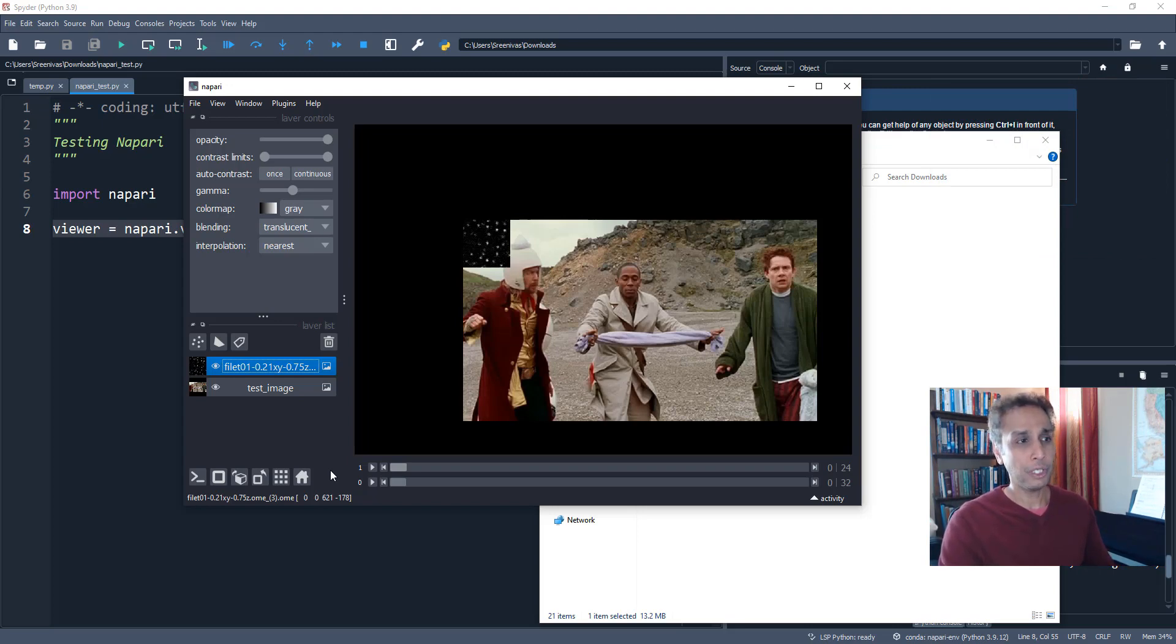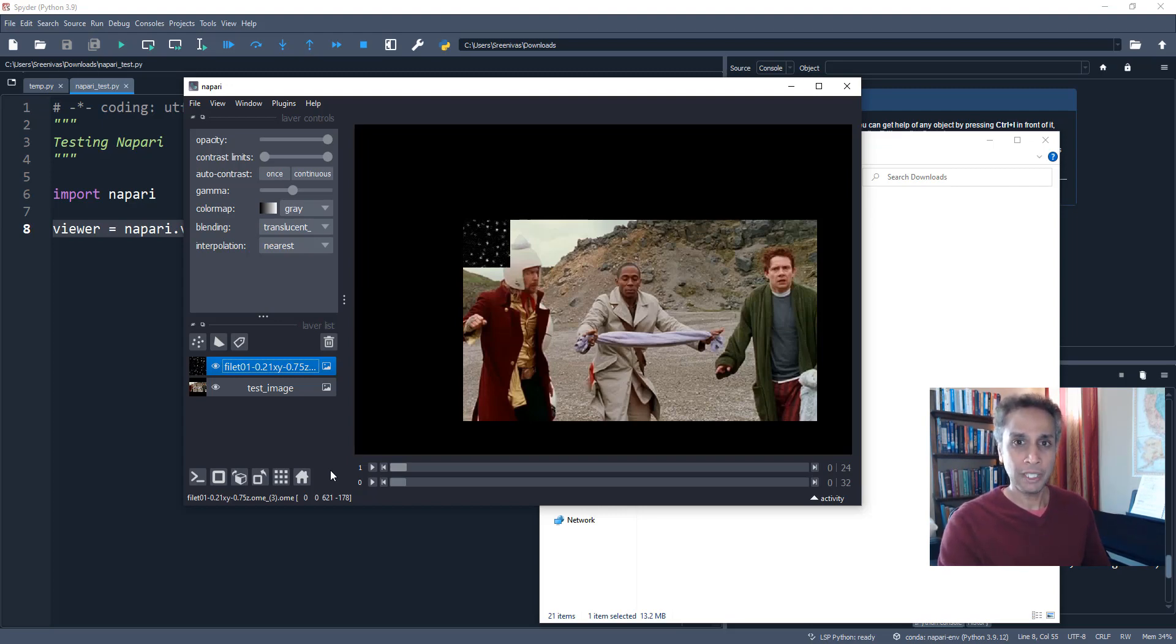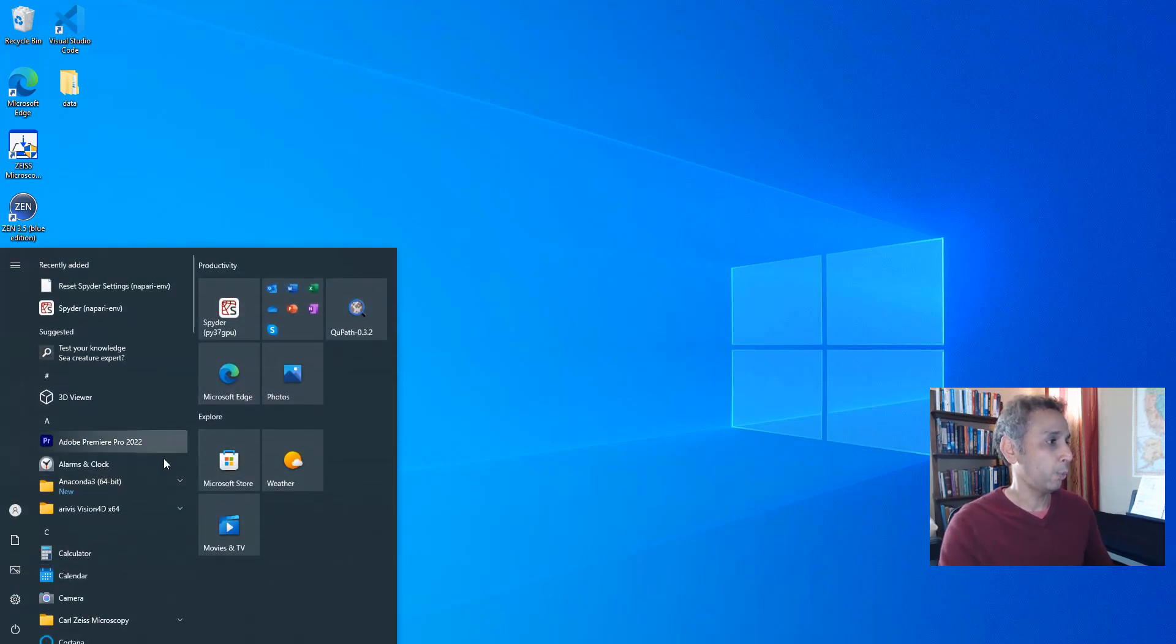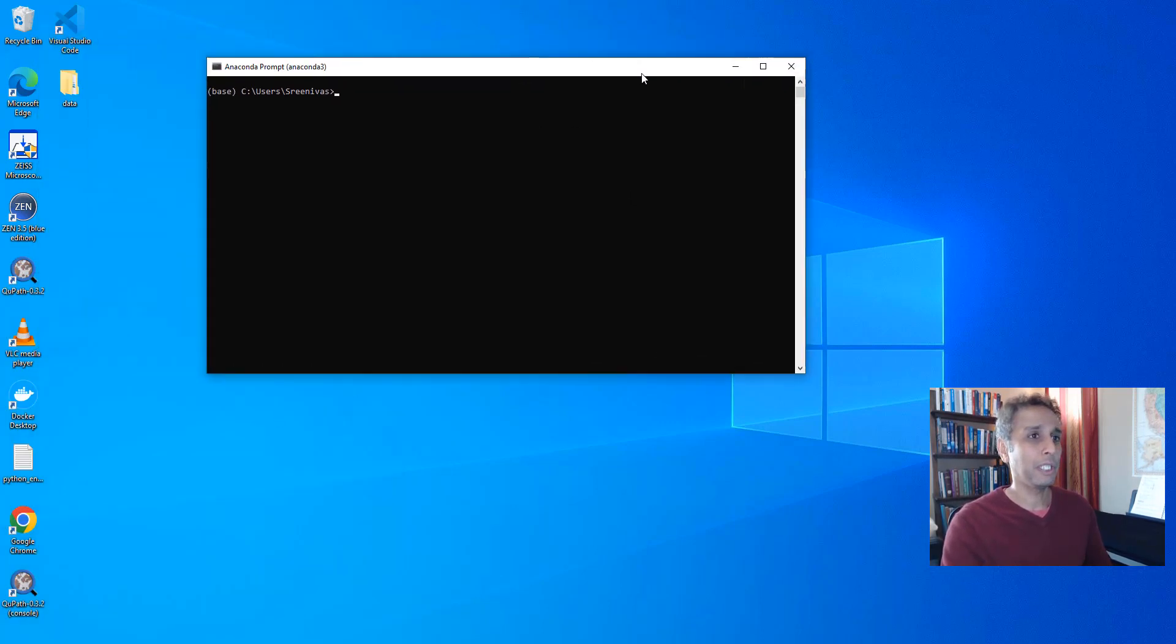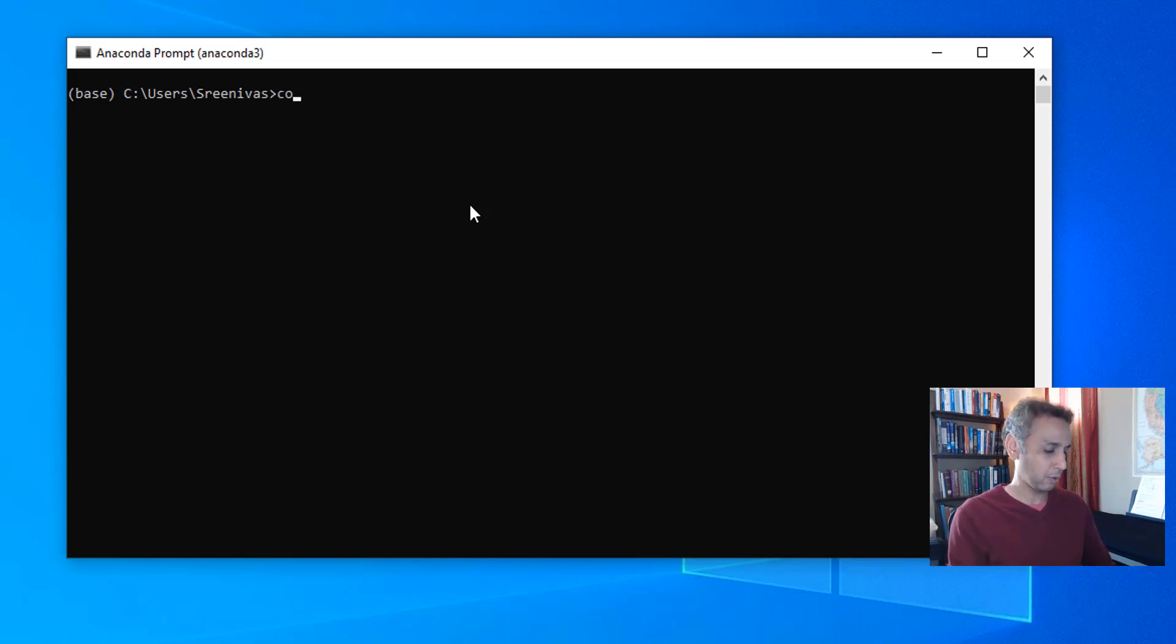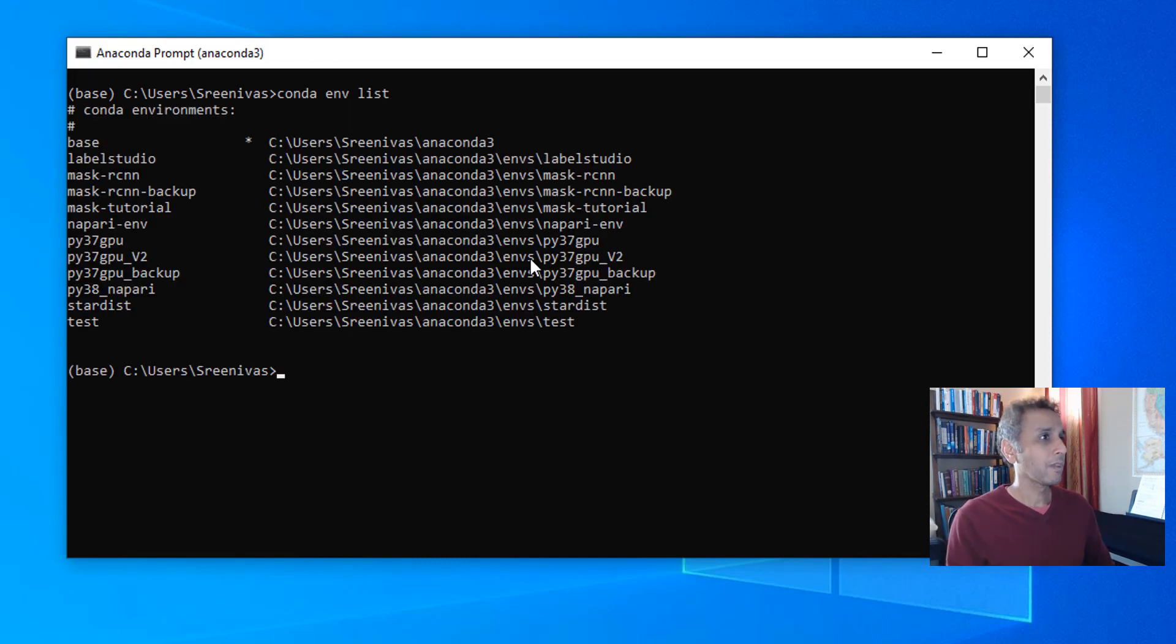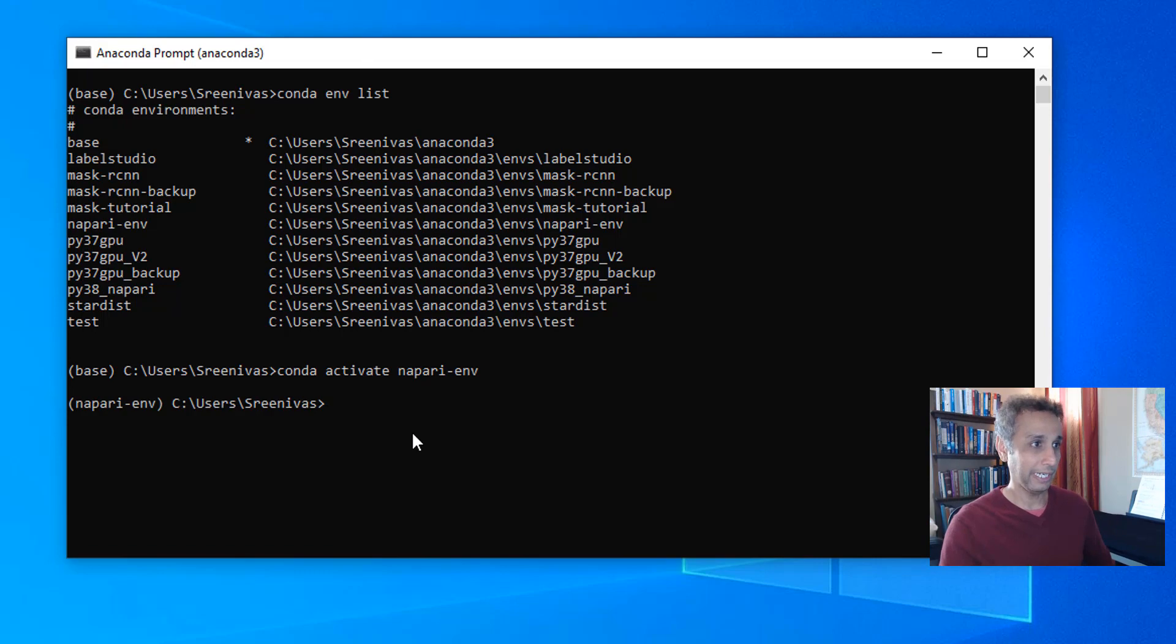And I'm not sure how to change this view to a 3D image. Again, I don't want to get into that yet. Let me get familiarized with it. I don't want to explore the software while recording a video. I am recording a video to share my experience of installing Napari just by following their direction. So it basically comes down to pip install. That's it. And it seems to be working. Now, if you just want to explore the viewer on a regular basis, I don't think you need to fire up your IDE or anything. So just before I quit this video, one last test. Let me open my command prompt and see if we can fire up Napari just from writing a couple of lines. Okay, so first thing first, let us go ahead and open any of our command prompts. Let me put that in the middle of the screen so it's easy for everyone to see. And first thing, let's change the environment. So first of all, conda environment list. What do we have? What environments? Yep. There you go. Napari-env. This is the one that we want. So let us do conda activate napari-env. And now it's activated.